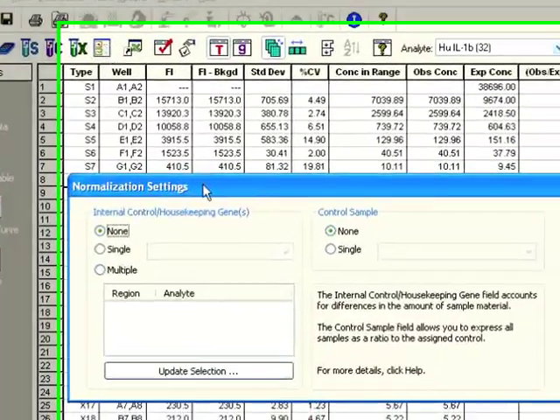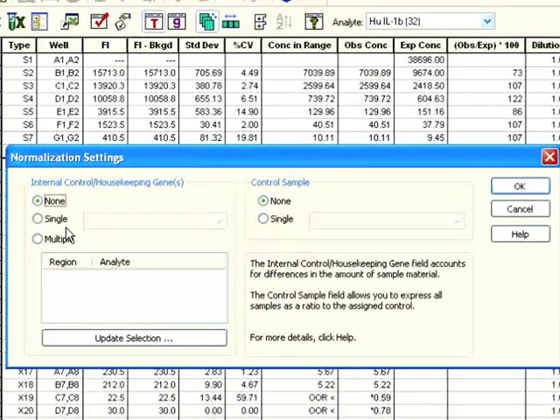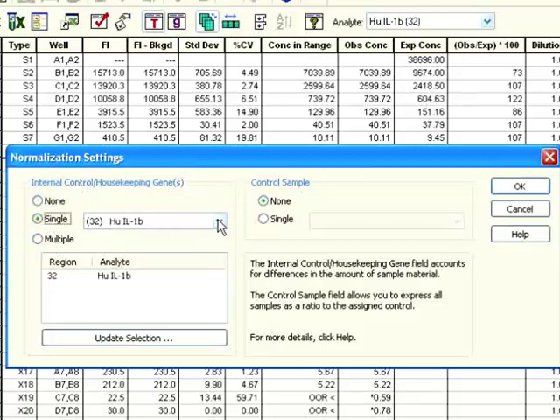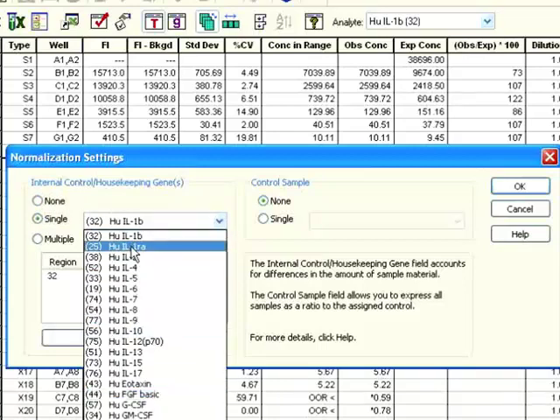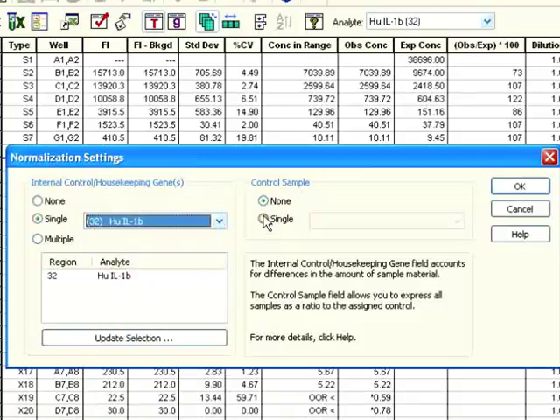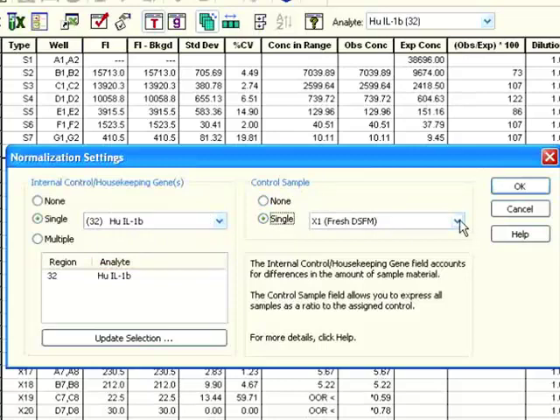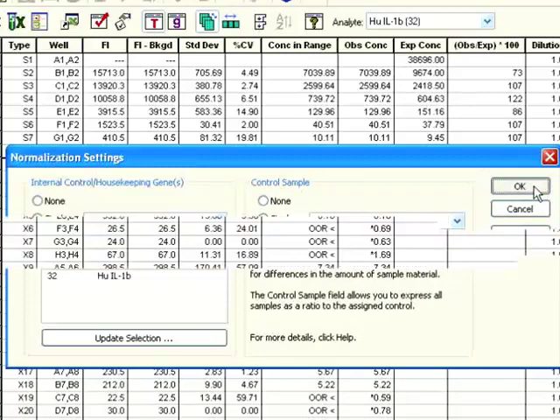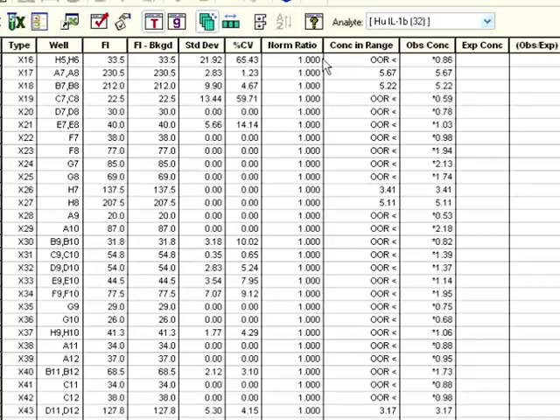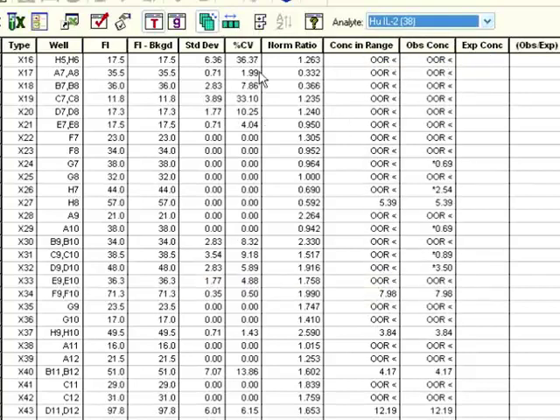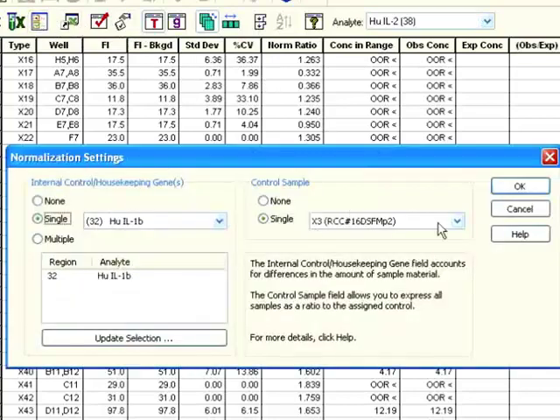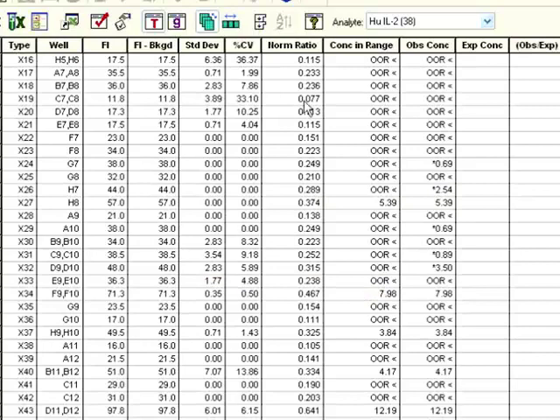Another nice feature in the software is the ability to do normalization. For example, if you're doing a phosphoprotein assay with a 10-plex and one analyte happens to be stable across all your conditions, you can set it up as an internal control to control for variability across your samples. You can even set up a control sample to do ratiometric analysis vis-à-vis one of your samples on your plate. If I click OK, I now have the normalized ratio versus one of the samples. The normalized ratios are different, and it's very straightforward to make these changes as many times as you want.